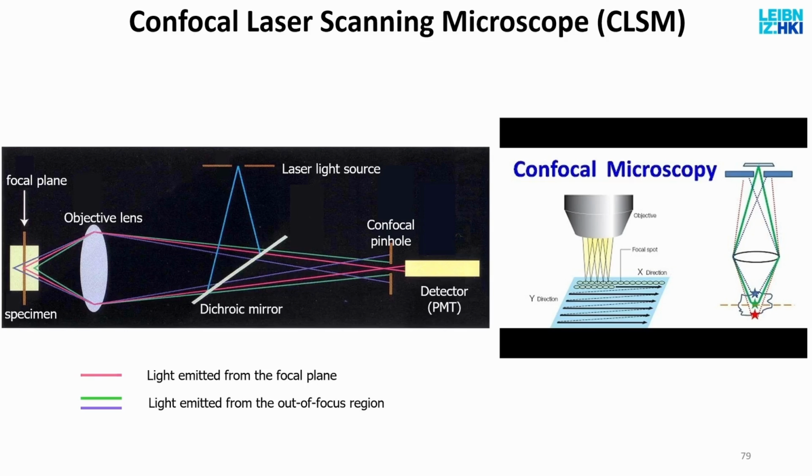The position of this object, this object is called a pinhole, for obvious reasons, has to match the focal point of the system. So the focal point here and there must match. The two focal points match. If this is positioned wrongly, then what you get in the detector is not what you are looking at. So it's misaligned from the focal point. In older systems, you can do this yourself. In new ones, it's fully automated.